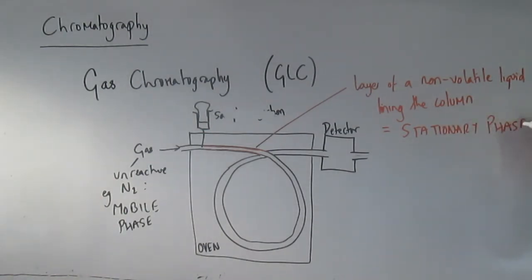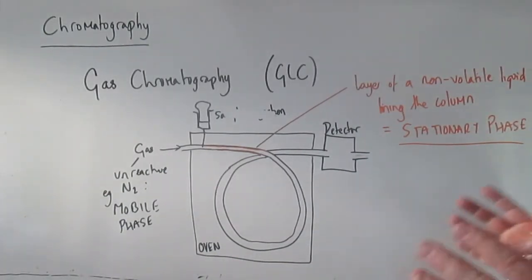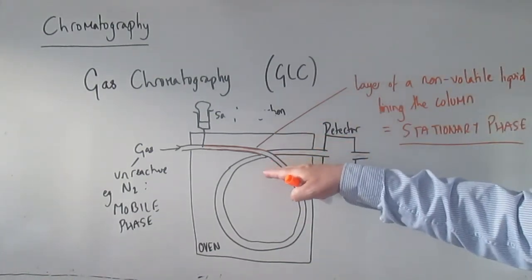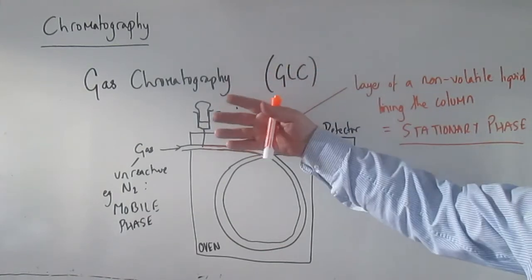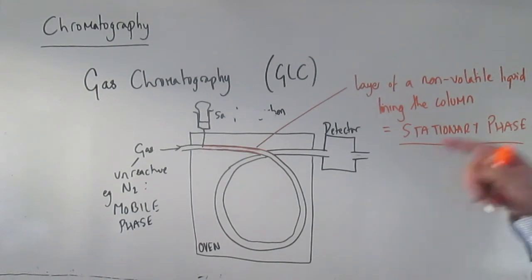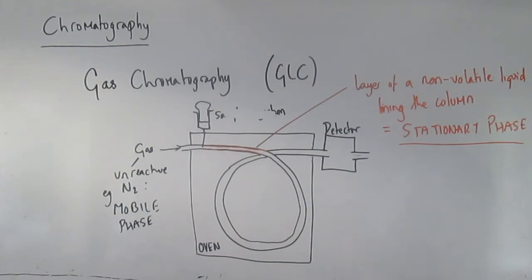Okay, so what's really important is that you see the difference from TLC. In TLC you also had a liquid phase, but in that case the liquid was moving. So the liquid, the solvent, was the mobile phase in TLC because it was moving. Here you also have a liquid whose function again is to dissolve the substances being analysed depending on their solubility, but here that liquid isn't moving, it's sitting statically lining the column, and therefore its job is the opposite, it's to slow down the movement of the substances through the column.